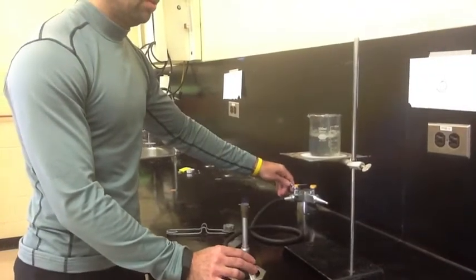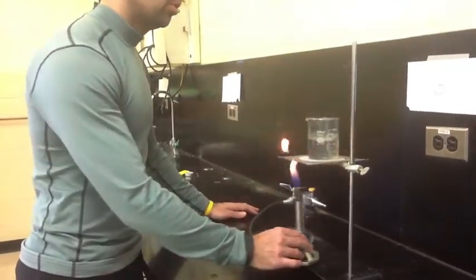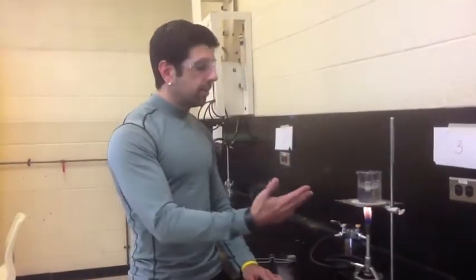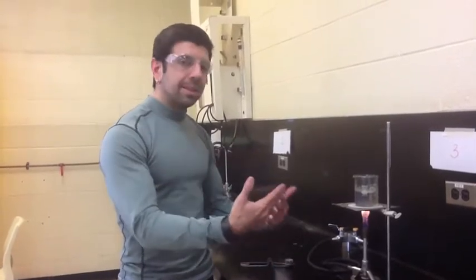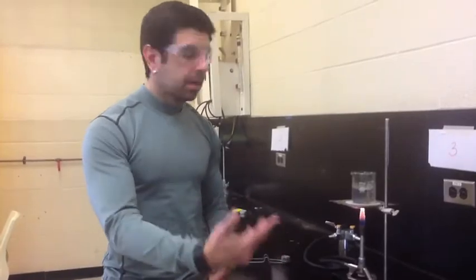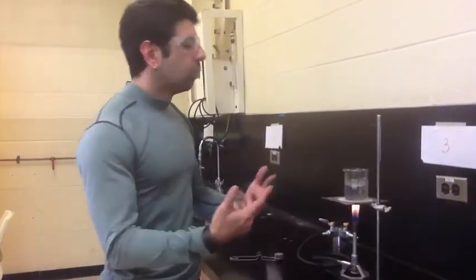And pretty much just hold it right underneath here. Make your observations, but make note of what is so special about the end result of this reaction when we are heating water.